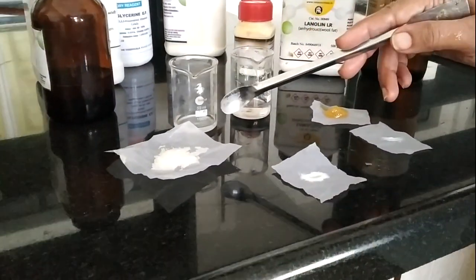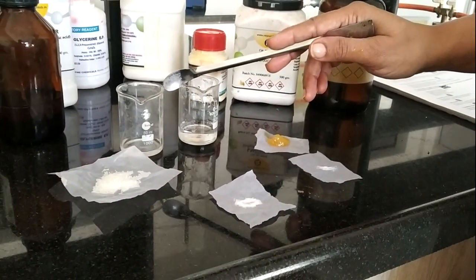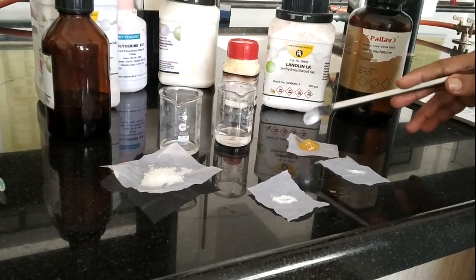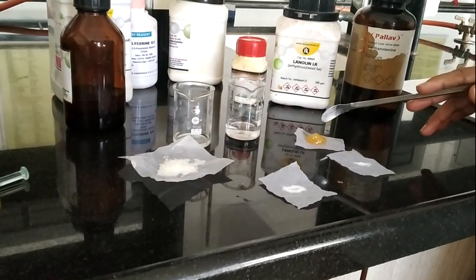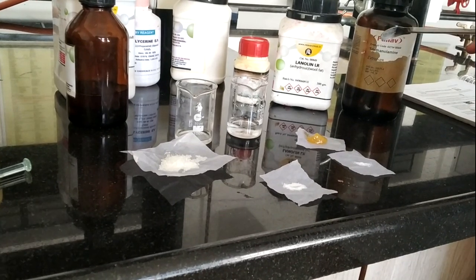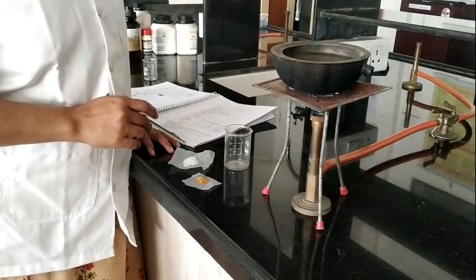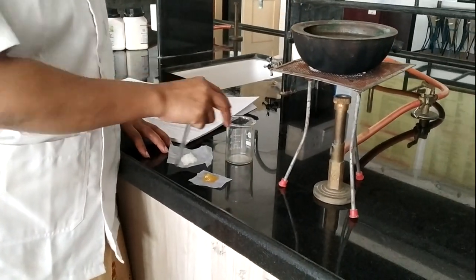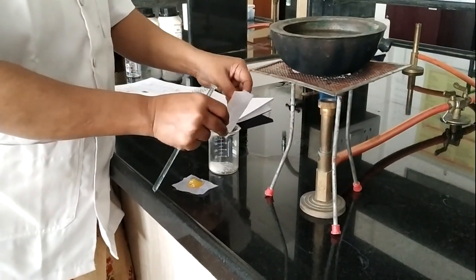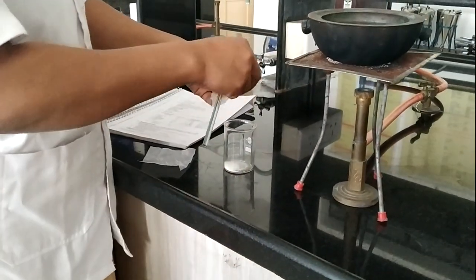Here we take 1.8 gram of stearic acid, then almost 0.3 gram of glycerin, then 0.2 gram of lanolin, methyl paraben and propyl paraben. Later on we take the triethanolamine, that is 0.1 gram. Here we take the stearic acid and lanolin, take one beaker, in that add stearic acid and lanolin.